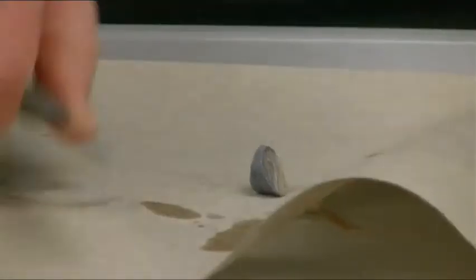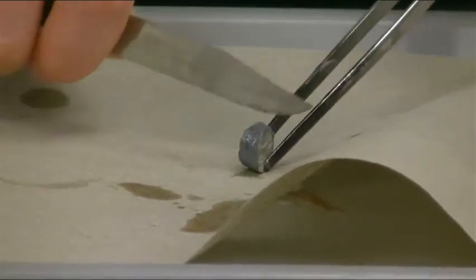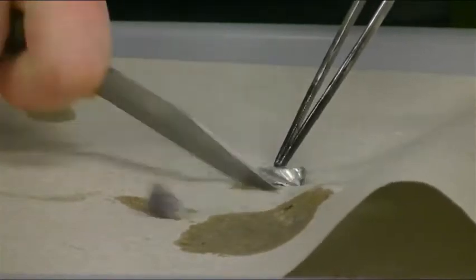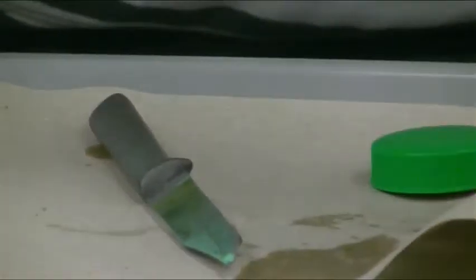Beautiful. Let's take the excess away. I guess we could do smaller than that. And yeah. I think that you should just go up and point straight down at this one because we're going to do that with the other ones. You know what I mean? The part where you can see the difference between the oxidized color and the shiny metal is really good. Like on that one. Super nice. Super good. Yeah, you can really tell on the camera.